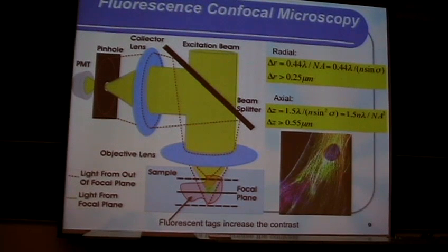The fluorescent dye molecules in the sample are excited mostly in the vicinity of the focal plane in this focal region. However, the dye molecules outside of this focal region of interest can be somewhat excited too. So then, in the epifluorescence mode fluorescence confocal microscope that's depicted in here, the fluorescent light is detected in the backward geometry using the very same objective lens shown in here.